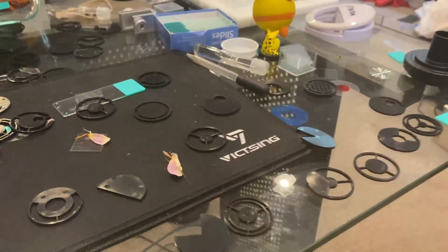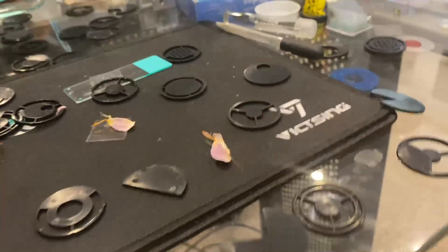When you go up to 600x, you need the bigger filter to get dark field. Obviously there are a lot of these. You can experiment with them, play around with them, and you can stack with the Reinbergs — that gets you even cooler effects and makes it even fancier looking. Thanks for supporting our microscope Kickstarter. The Reinberg filters are in our warehouse now, the microscopes are waiting to be shipped, and these filters are also being manufactured as we speak. We had to make these from scratch and were a little worried, but they slide in perfectly now and the effect is just so fantastic that I'm so glad we did it. Thank you, and we'll be back with more updates soon.